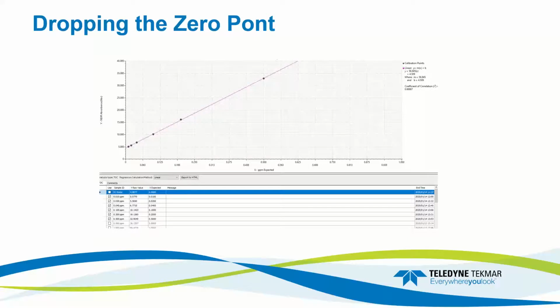The updating button will be flashing in the software, and it'll basically update this, and here's your new calibration curve that's not forced through 0. So by not forcing it through 0, we're going to allow for understanding what's in our reagent water, what's in our acid, what's in our persulfate. It's going to allow us to understand what type of contribution the system and the overall reagents, water, and chemicals are giving to us, so we can get a good, clear, accurate measurement.